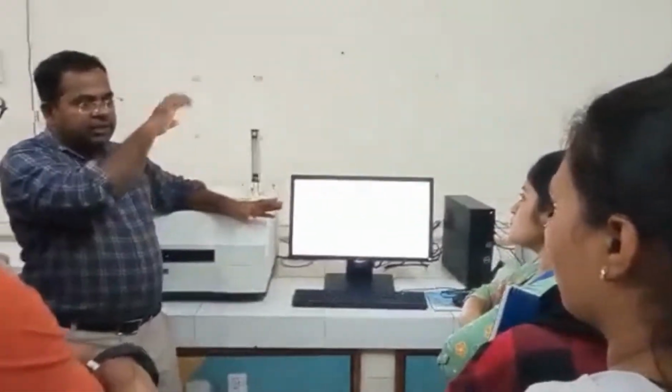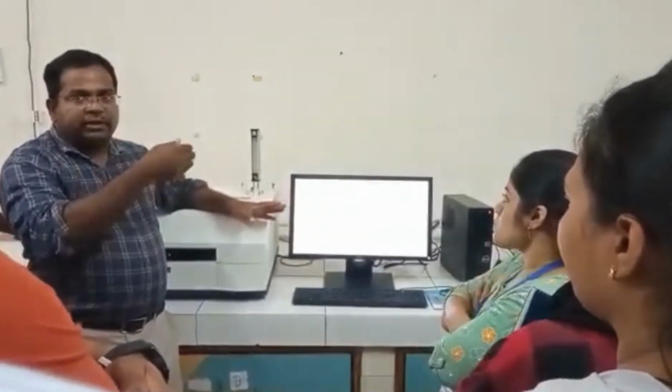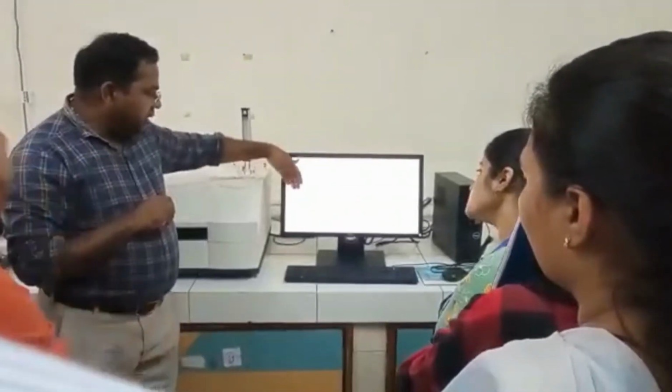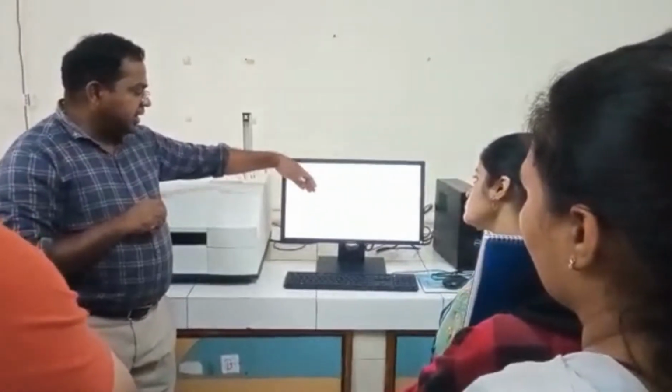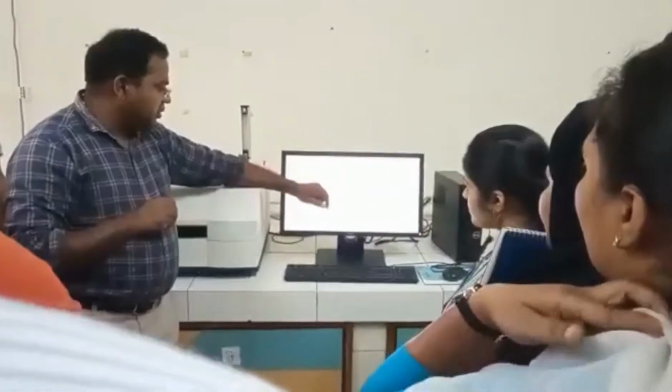They will uncheck the save button. Second step from 300 to 500 with a lower heat rate and they save. So whatever portion they really require, that much data they will get. Okay. So like that you can make it n number of steps. Only thing is whichever step you really require to save, that much you have to save. Okay.